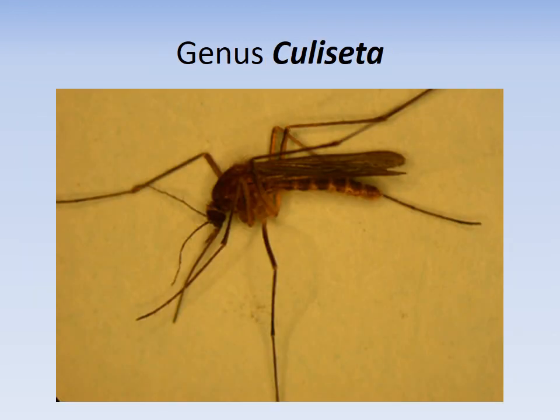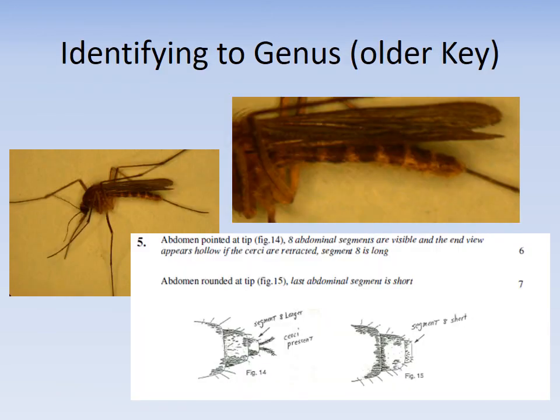So your specimen is the genus Culiseta. I believe you can now go farther into the book to see the genus Culiseta, which is divided out into species, and you can look and see which species it is. I think there's only 2 in there, Inornata and Melanura, but I could be wrong. There could be a couple more. I know there's much more in the United States, but I can't think of another one that's in this area.